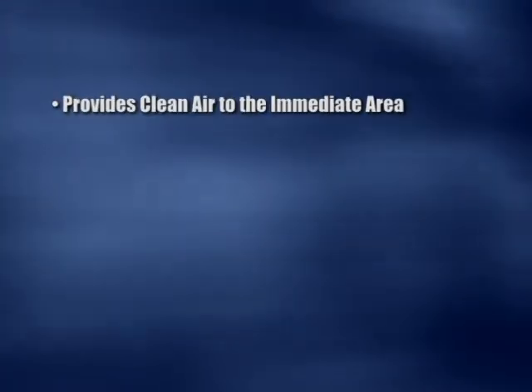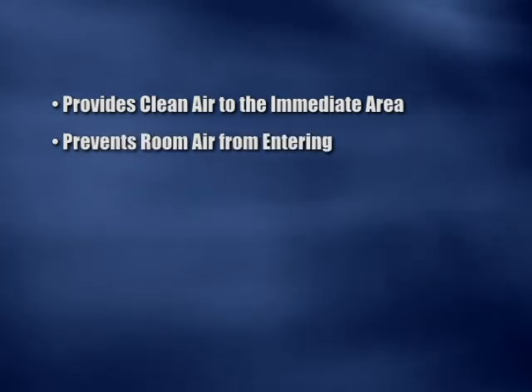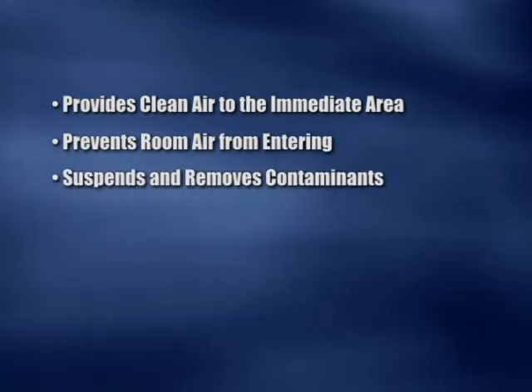A laminar airflow workbench is a primary engineering control or device that provides the following aspects for aseptic compounding: clean air to the immediate aseptic compounding area, prevents room air from entering, a constant flow of air out of the work area, and an outward flow of air that suspends and removes contaminants introduced into the work area by personnel.